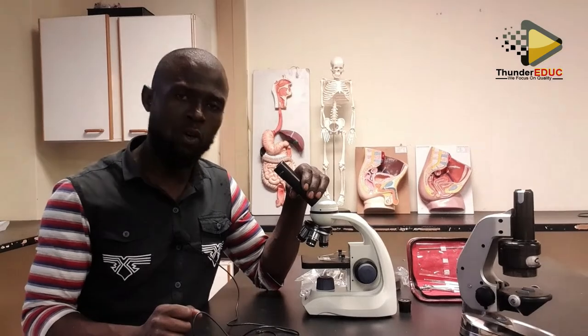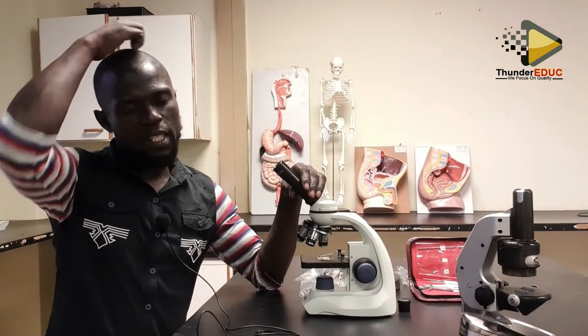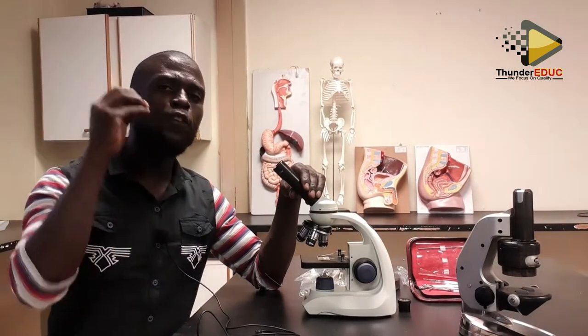So, why do we need the electron microscope? These ones are also limited. They can magnify, yes, but they cannot see some parts. For example, you want to see the inside part of the chloroplast. You cannot use a light microscope to see the inside of the chloroplast. Chloroplast is too small. So we have to use the electron microscope. The disadvantage with the electron microscope is that it can only view objects when they are dead. You have to first kill it and then you use those objects.